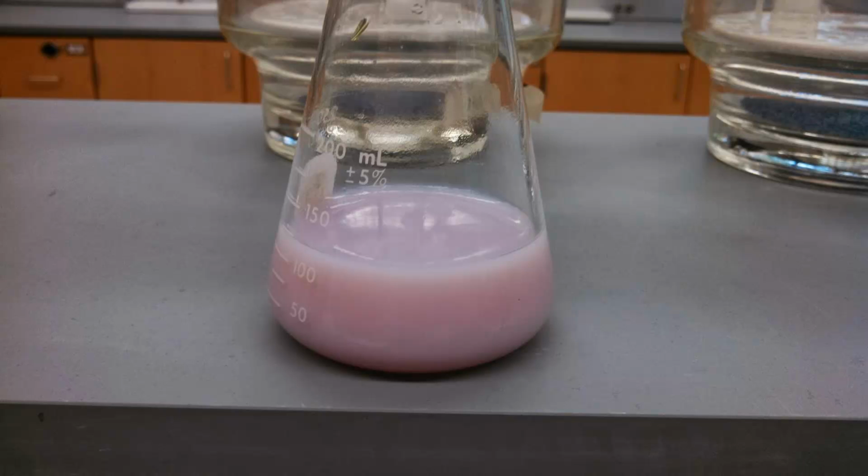This pink color will actually start to get dull and turn a little bit purple after it sits on the counter for a while, so you should not have a flask where you think the endpoint is good, have it sit there until your next titration, and then compare, because the color will change over time due to photodegradation of the silver nitrate. So don't try to make that comparison. Evaluate each individual endpoint on its own.